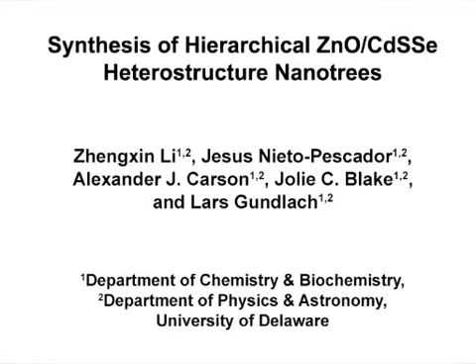The overall goal of this experiment is to synthesize a tree-like nanostructure with zinc oxide stems and cadmium sulfoselenide branches, and characterize its morphology, crystal structure, and optical properties. This method can help answer key questions in the application of nanocomposite materials in optical and electro-optical applications.